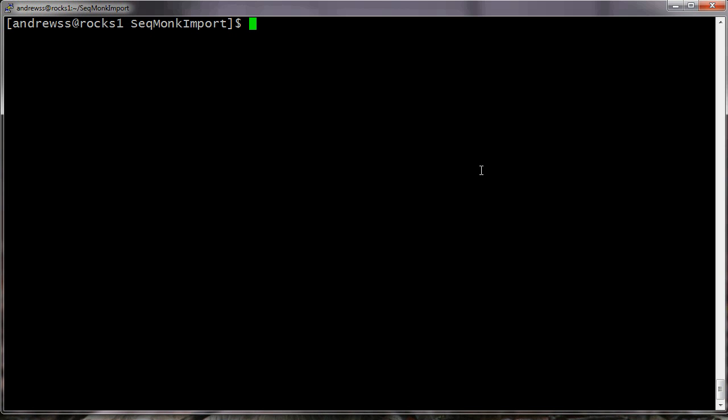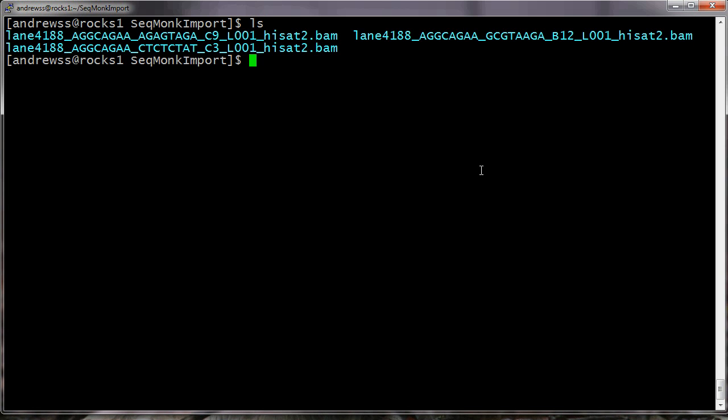I'm going to show you how this works. I've got a set of three BAM files here, and I'm going to import those using the SeqMonk import program into a project file. So SeqMonk is already installed on this machine, and SeqMonk import comes as part of the standard SeqMonk installation.